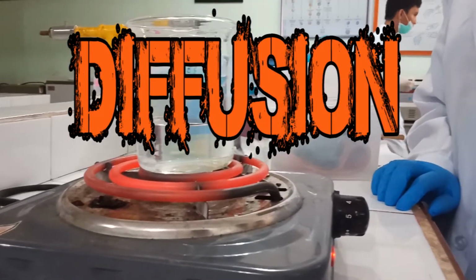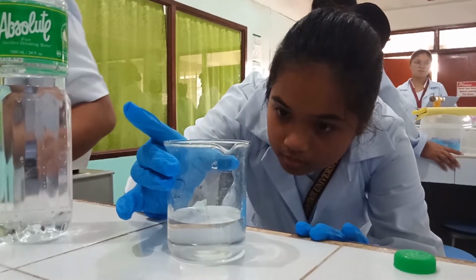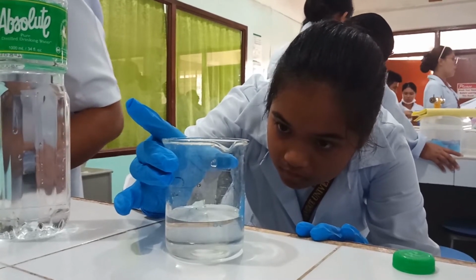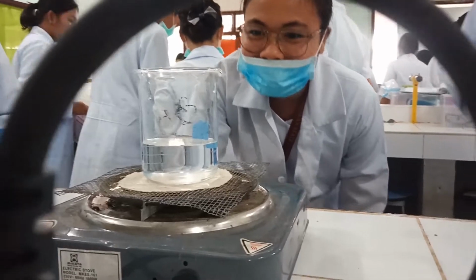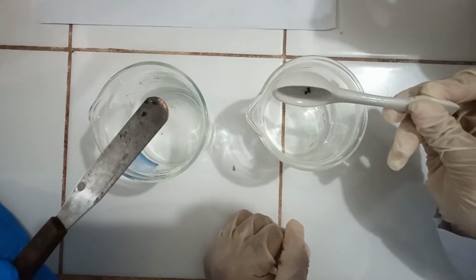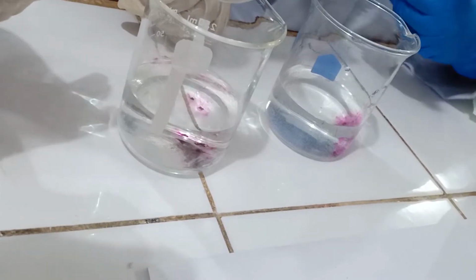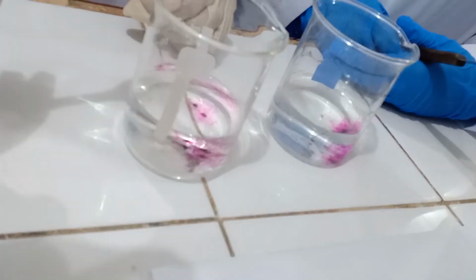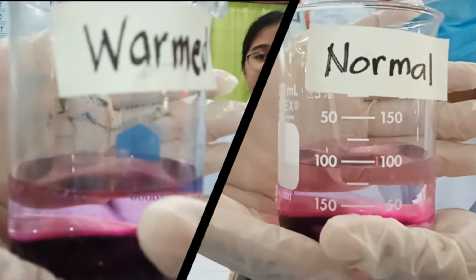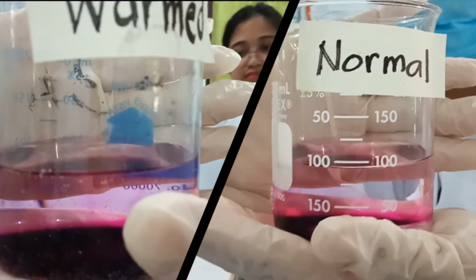Procedures for diffusion. First, fill 250 ml beakers with 100 ml of water each. Second, warm the contents of one beaker. Then, drop at the same time 2 to 3 crystals of potassium permanganate into each beaker. Last, observe and compare the rate of diffusion of the solute.